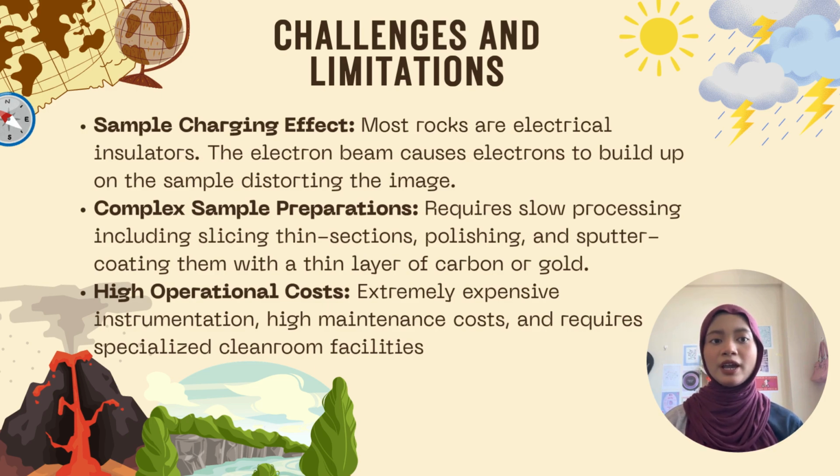When hit by the high energy electron beam, negative charge builds up on the sample surface, which distorts the final image. To fix this, we have to go through complex sample preparation. This requires a slow, meticulous process including slicing the rocks into thin sections, polishing them completely flat, and sputter coating them with an ultra thin layer of carbon or gold to make them conductive.